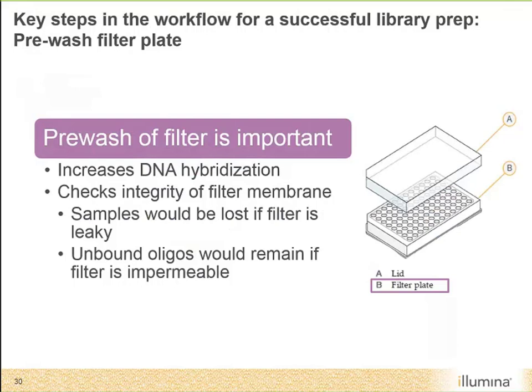If there are any wells within the filter plate that don't seem to be filtering very well, it can sometimes be very tricky because the filter plate is very shiny. So when you're looking over it, it can be a little bit tricky. That's okay, we understand that. If you have any questions about making sure the filter plate is filtering properly, or you have any concerns that a few wells within the filter plate aren't filtering, please give tech support a call. We're happy to help.